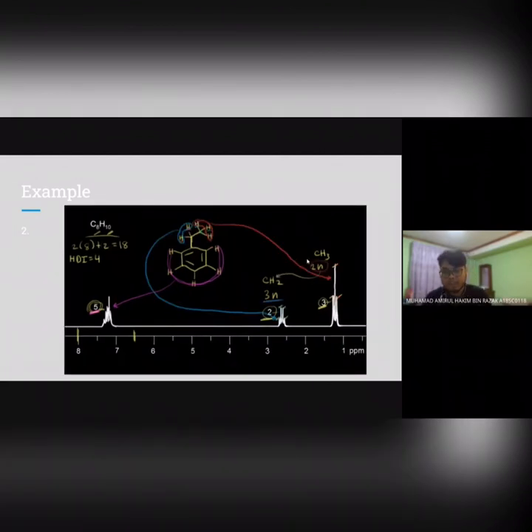Okay, yang seperti saya cakap tadi, dua neighbor ni daripada peak CH3 ni datangnya daripada CH2. Okay, kalau kita boleh lihat, ini adalah sketch yang terakhir. Okay, sebab apa kita tahu CH2? Sebabkan CH3, okay, kalau kita boleh lihat CH3, lepas tu dia ada dua neighbor. Dua neighbor ni adalah CH2 daripada peak sebelah ni tadi. Yang warna biru ni. Okay, itu dia. So, kita boleh lihat yang warna merah ni adalah CH3. Kita confirmkan balik. Okay, CH3, peak yang CH3 untuk peak yang terakhir.